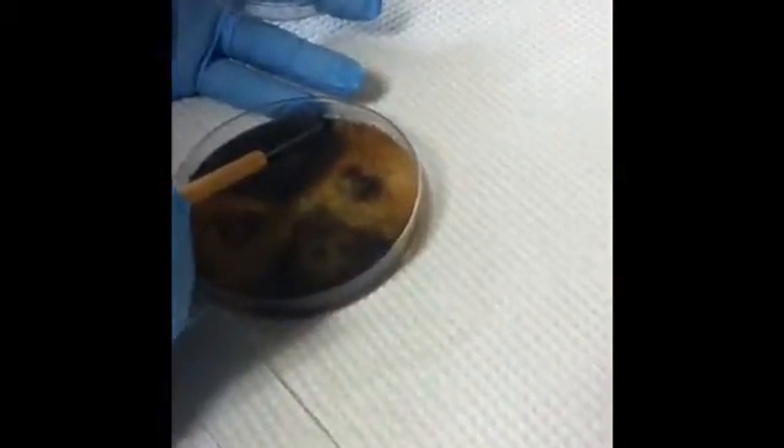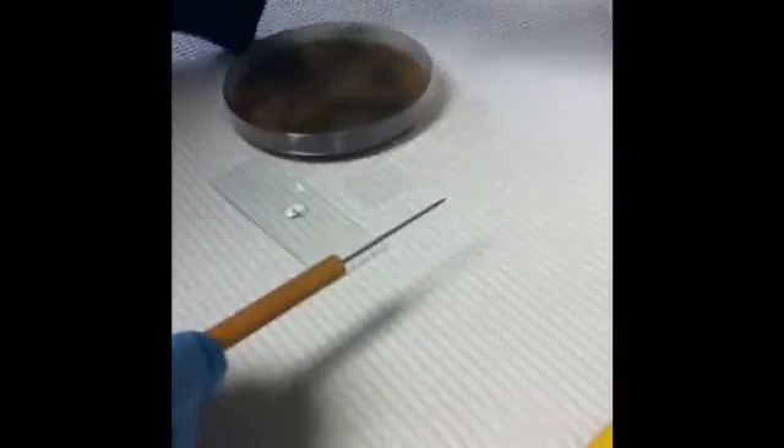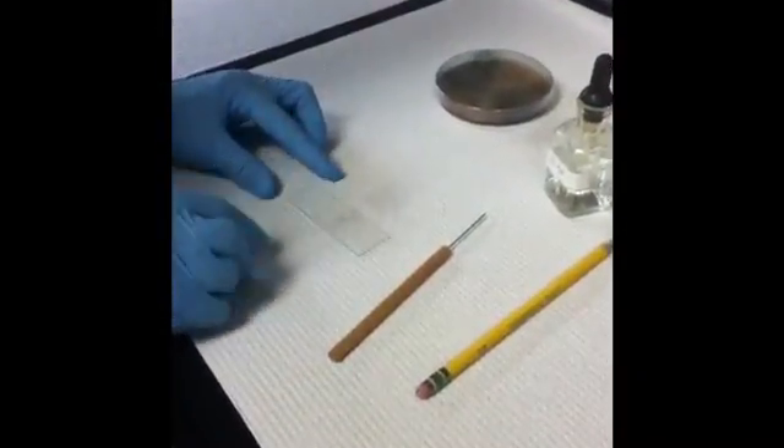I'm using a dissecting needle to get a piece of perithecium and put it on the slide. You can also use a drop of DI water. Don't use a coverslip. You can press down with the back of your dissecting needle or the eraser of a pencil — just smash them down a little bit.